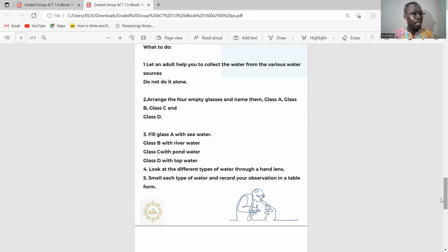All right. Then we have the seawater. Okay, so this is my seawater. I got it from the sea. The seawater looks a bit clear in terms of color, but you can see some tiny, tiny particles running through it. Okay, so because of that, it's disqualified.